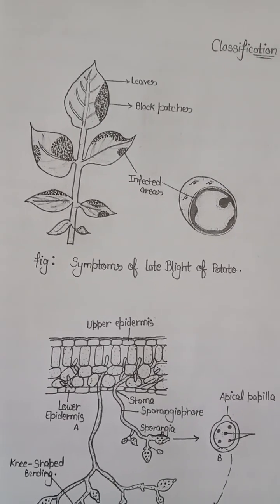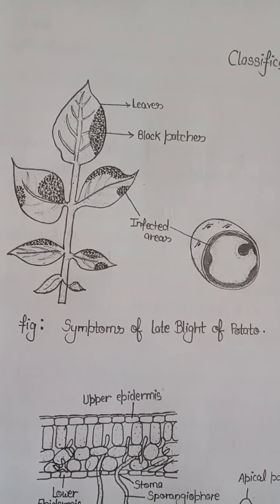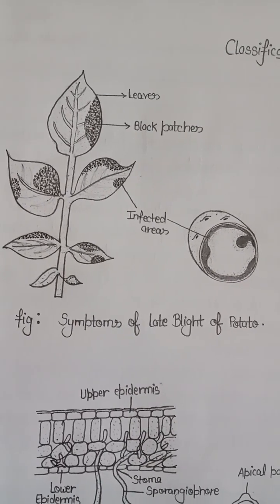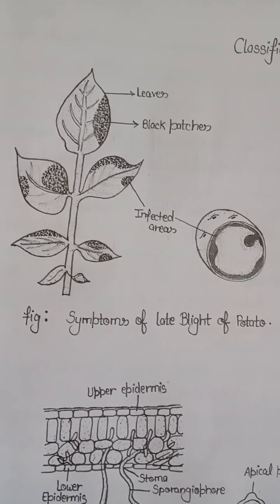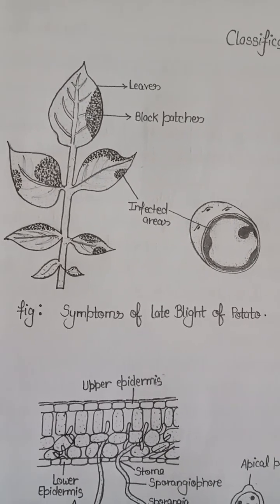So now let's move on to the content. First, we have discussed the experiment of algae. Now today we are going to represent the experiments of fungus. So let's move on to the experiments.